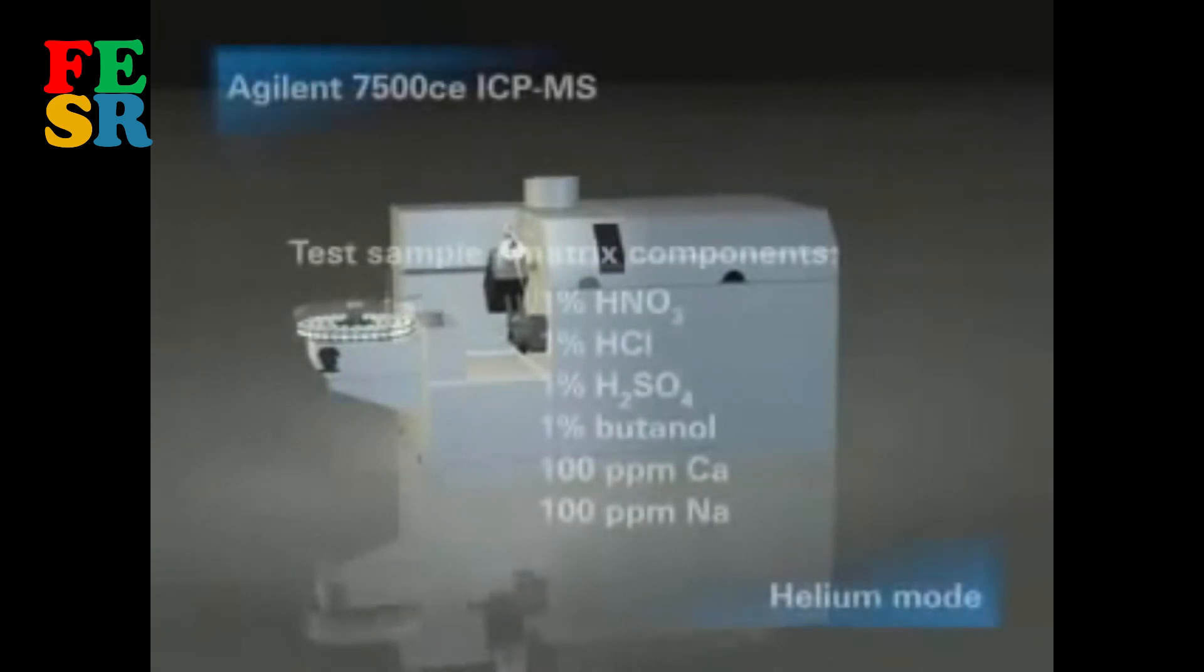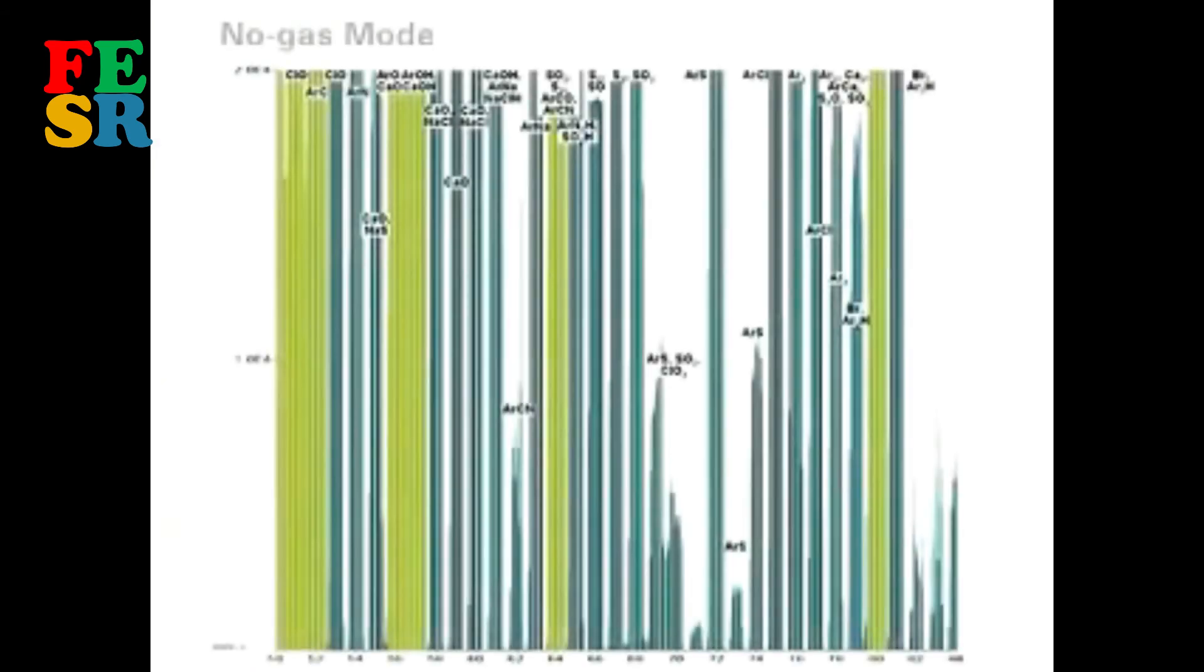To illustrate the interference removal power of the helium mode, a very challenging sample matrix containing these components was analyzed. Spectra were obtained for the mid-mass range where most polyatomic interferences occur. This spectrum shows the matrix interferences that occur in normal ICP-MS.